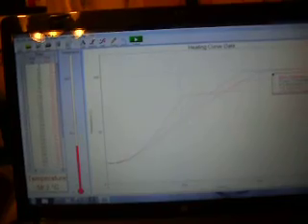Okay. Now we've generated heating curves for all 5 of our liquids. We have water, we have vinegar, we have the isopropanol at 91%, the isopropanol at 70%, and then this curve in here is our witch hazel. So from this, do all liquids boil at the same temperature? Bobby, what do you think? No, you're right, they don't.